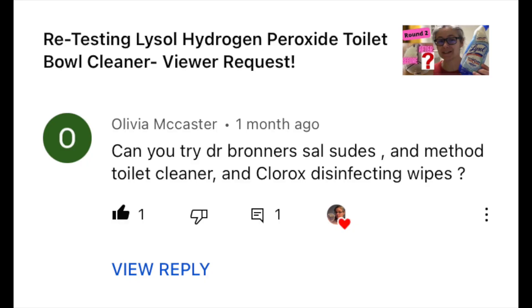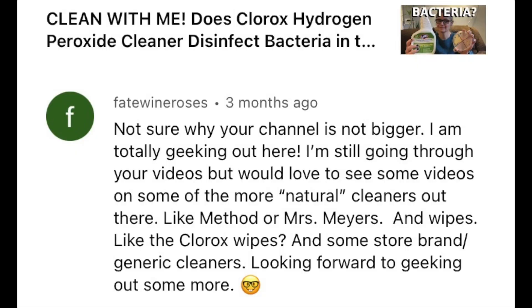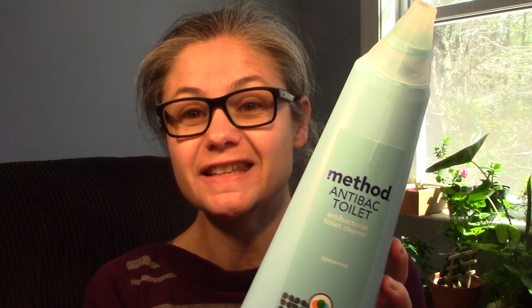Hi everybody, today my focus is testing the disinfecting power of Method Toilet Bowl Cleaner. This video is a viewer request — Olivia McCastor suggested I try Dr. Bronner's Sal Suds, Method Toilet Cleaner, and Clorox disinfecting wipes. So Olivia, this one is going to be the Method Toilet Bowl Cleaner. Fate, Wine and Roses also suggested I test out some of Method's cleaners. The full name is Method Antibac Antibacterial Cleaner in Spearmint.